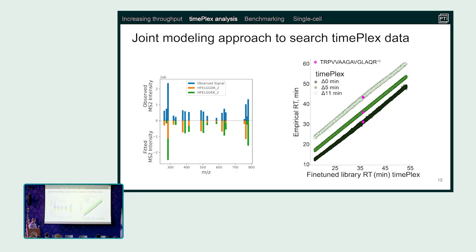And so I was really fortunate to have Kevin talk before me. So how to go about actually analyzing this data ends up being very similar to exactly what Kevin had said. The only difference now is that we're going to need defined retention times, expectations of when a peptide is going to elute for a given sample. As long as we can have that, then we're going to have sample specificity for each peptide. We're going to know each peptide originated from a given sample, and when we do the search, we can basically just set thresholds on when we'll consider a peptide to map to a given sample.